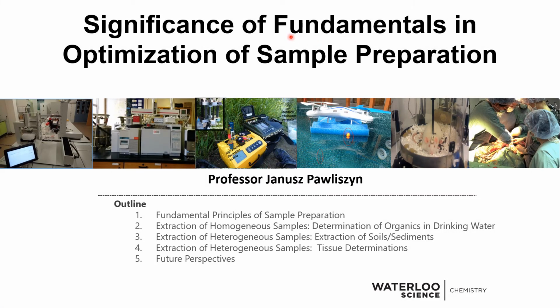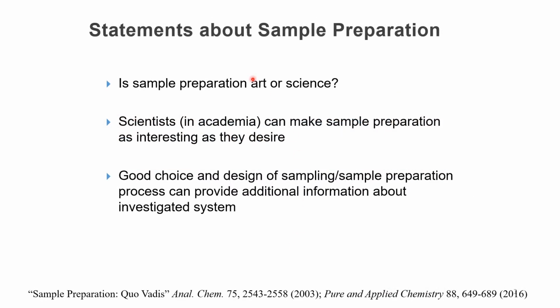In today's talk, I will focus on fundamentals of sample preparation. I will discuss how to use the fundamentals to optimize extraction of both homogeneous and heterogeneous samples. The present situation in academia is such that we don't specifically cover fundamentals of sample preparation as a separate topic. So I have been doing in my lab trying to develop those fundamentals.